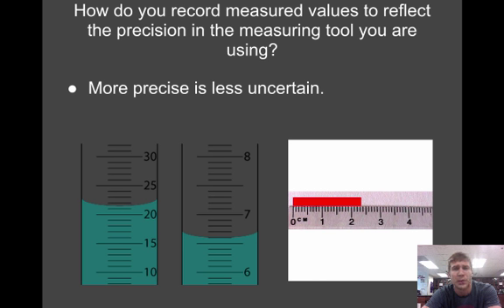If we compare that 50 milliliter graduated cylinder to the one on the right, which is an example of a 10 milliliter graduated cylinder, each line represents 1/10 of a milliliter. So when we record values using the 10 milliliter graduated cylinder, we're either going to 5/100ths of a milliliter or 0/100ths of a milliliter, depending on whether it's closer to the line or between the lines.